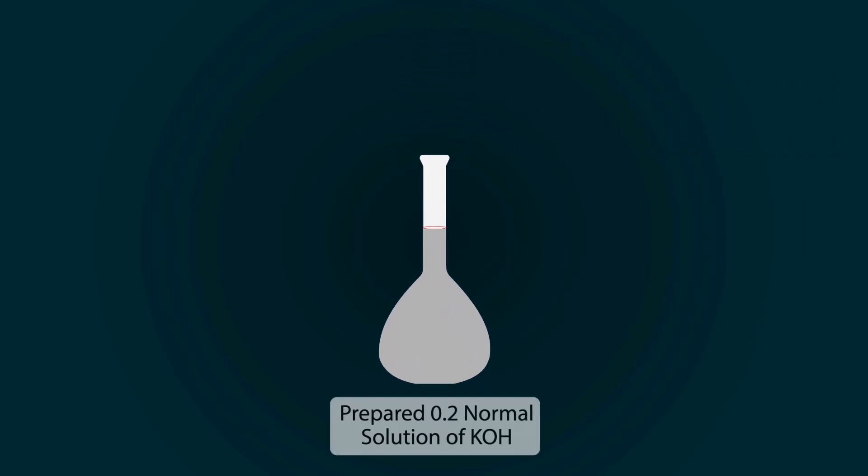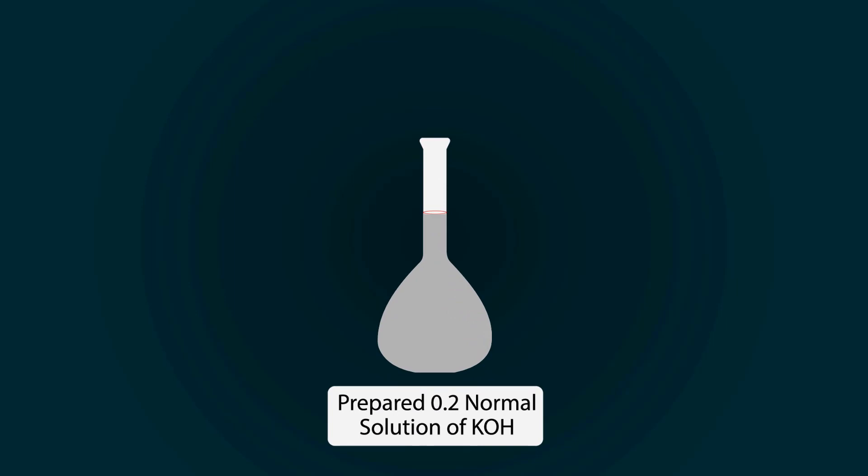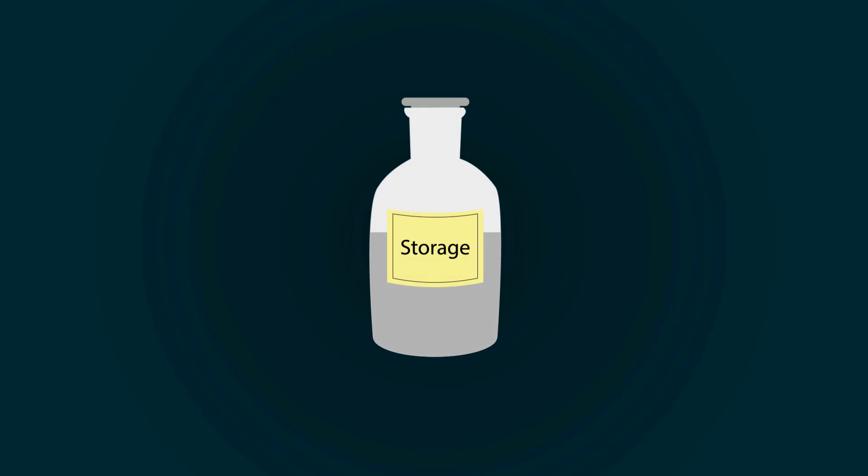We have successfully prepared 0.2 normal solution of potassium hydroxide. You can store it in a storage bottle.